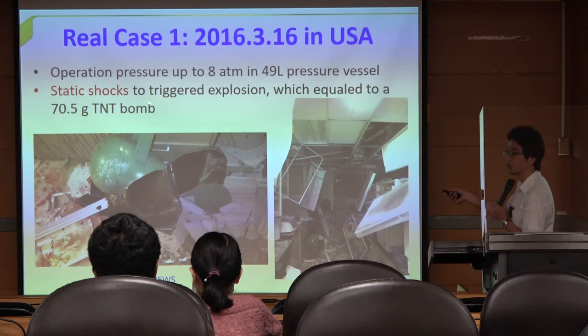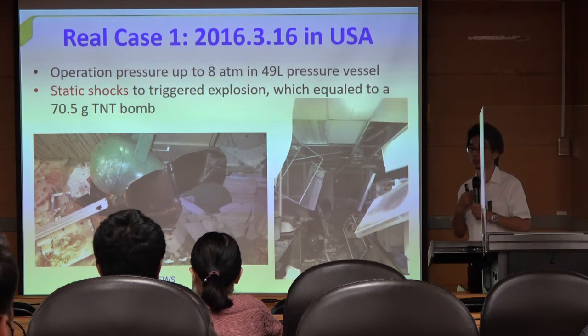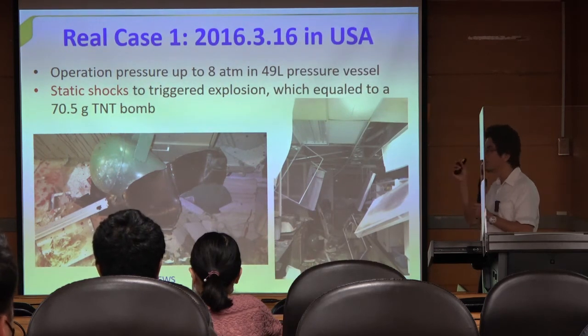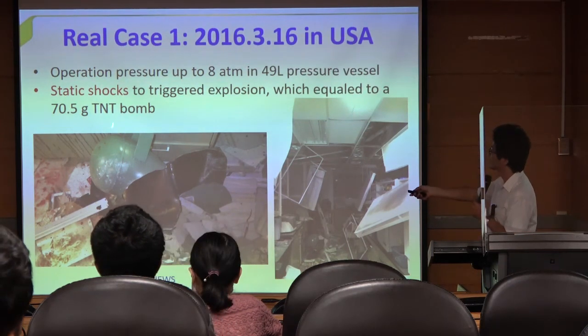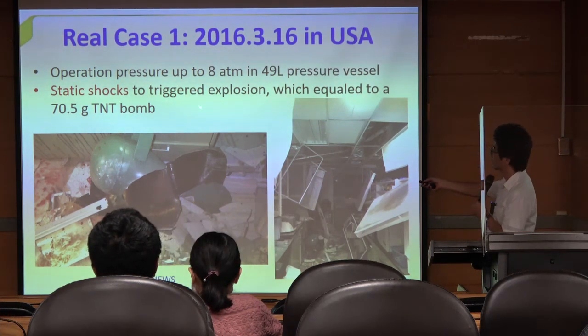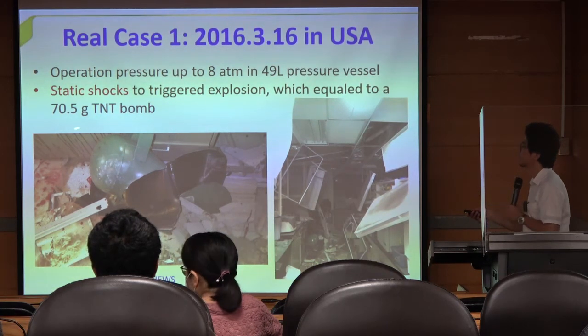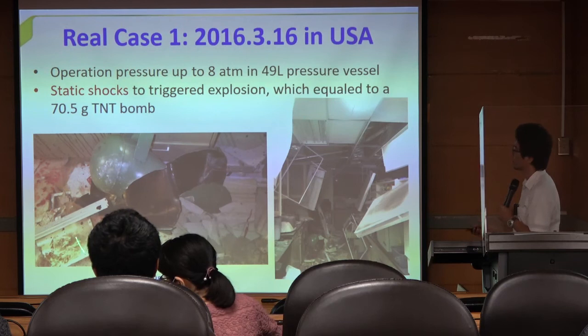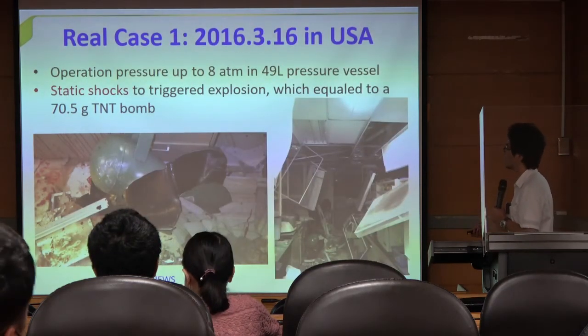You know static shocks, right? How to say it? In the winter, if you take off your sweater, the small electricity occurs on your clothes. It's the static shock. The static shock occurred and triggered the explosion, like 70 grams of TNT. So she was very seriously damaged.